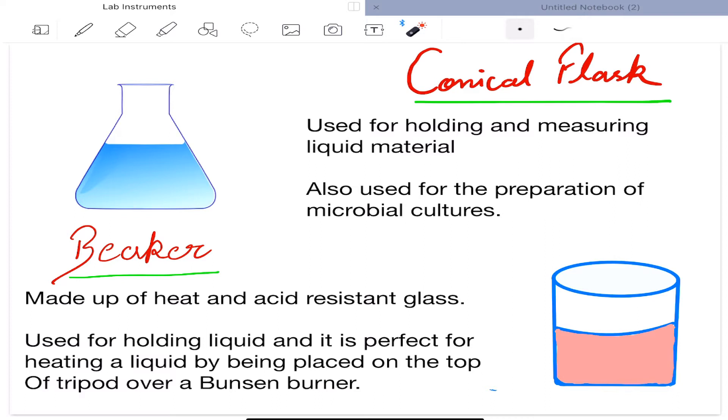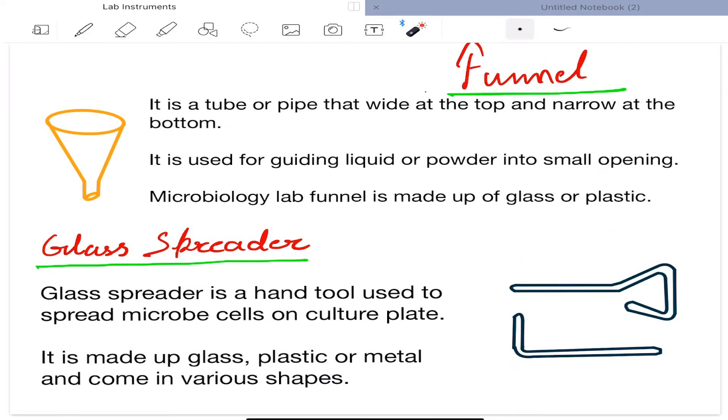Next is beaker. Beaker is made up of heat and acid-resistant glass. It is used for holding liquid and it is perfect for heating a liquid by being placed on the top of tripod over a Bunsen burner. Next is funnel. It is a tube or a pipe that is wide at the top and narrow at the bottom. It is used for guiding liquid or powder into small opening.